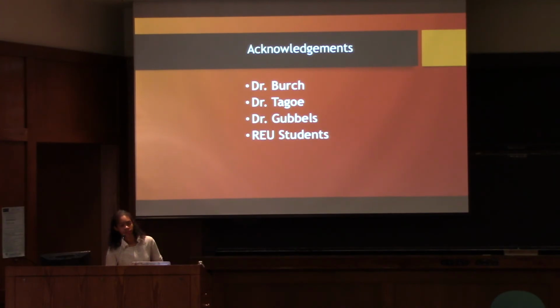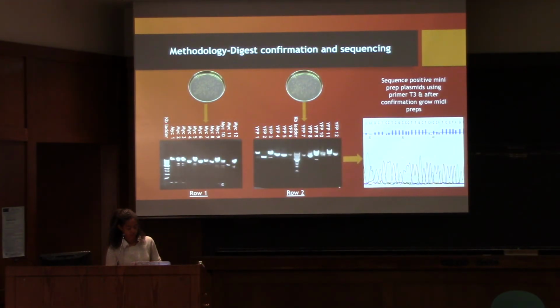Other questions? If you would go to the slide with the gel sequencing results, right there. Do you know why those bands are not clear, defined horizontal bands? They're kind of circular, kind of smeared. Well, I think it's because of the amount of time I let the gel run. Okay.